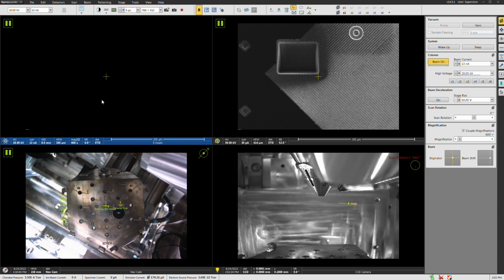You also have to keep in mind the effective operational range of the EBSD camera. Generally speaking, 10 kilovolts is kind of considered the floor when it comes to beam voltage for doing EBSD. Okay, I have not come across a lot of reports of EBSD being done below that. So that's kind of considered the floor, and then you could go up to as high as 30 kilovolts. So where would you want to go within that range?